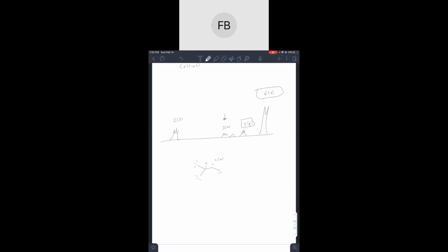So they're a quartet. Then would the hydrogens that you drew all the way to the left, that are pointing down, would those be 2 triplets? 2 triplets. Wait, where? Yeah, those 2. Okay, so those 2 are, yes, going to be 2 triplets. Where's the 2 triplet? Is there a 2 triplet? Yes, that's the 2 triplet all the way on the left. Sorry, I didn't even see it for a second. Yeah, that's exactly right. So these two are going to match up with this one right here, the 2 triplets. So that kind of follows through.